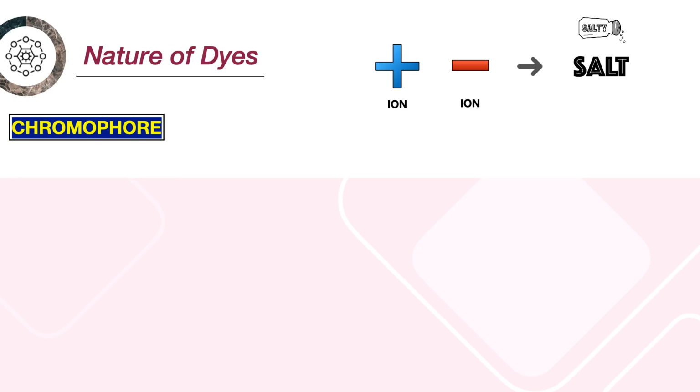Anong mangyayari doon sa other ion, ma'am, na walang kulay? Hindi yung ion na hindi magbibigay ng kulay, walang pulos? No, of course not. Yung ion na hindi chromophore, ma'am. What do you call that ion? We call that counter ion.